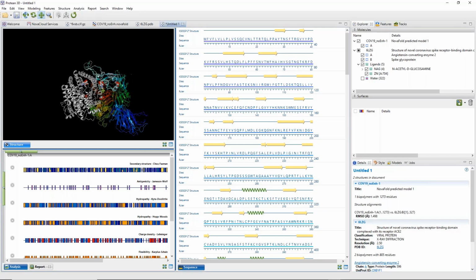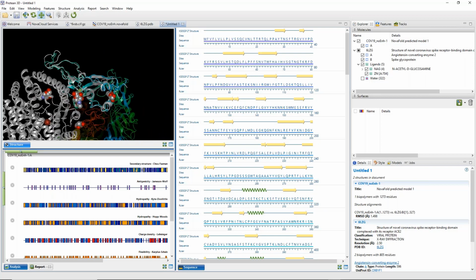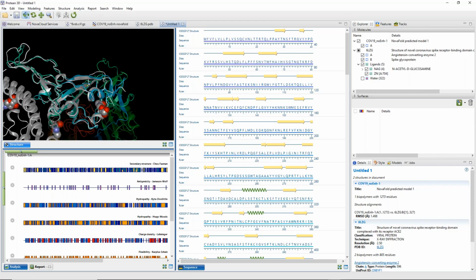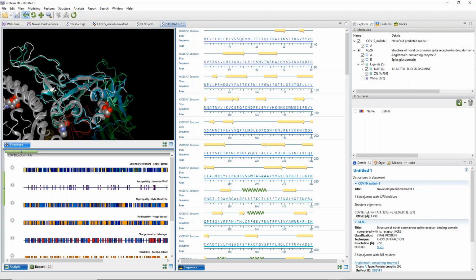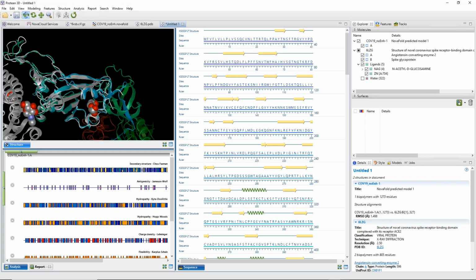Additionally, if we look closely at this model, you can see that there's some very close tracing of the actual model, and this is the RBD we're looking at right here. If we look closely at it, we can see that the predicted model is very close visually to the model that was just done a few months ago. And so we had this months before.